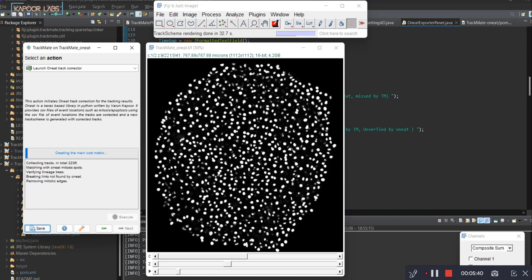So here it's actually still using the segment linker algorithm of linking the segments that Oneat has found, but locally and not globally. So it's solving a local cost matrix where it has a segment which has been identified as the mother cell track, and then it is having the segments in the next frame, but in a small region which you chose for the track linking part.